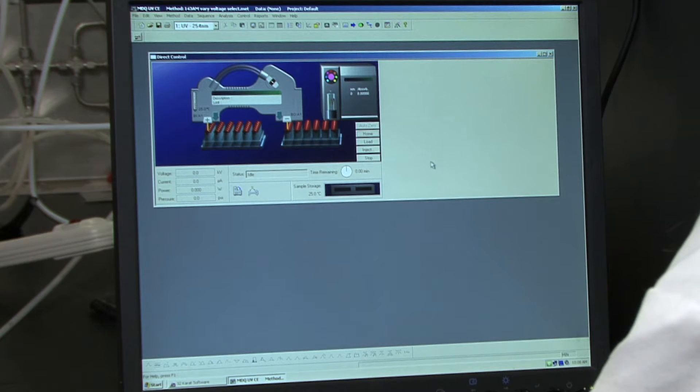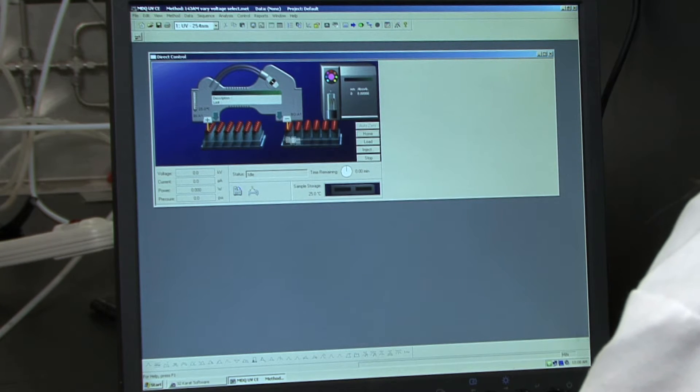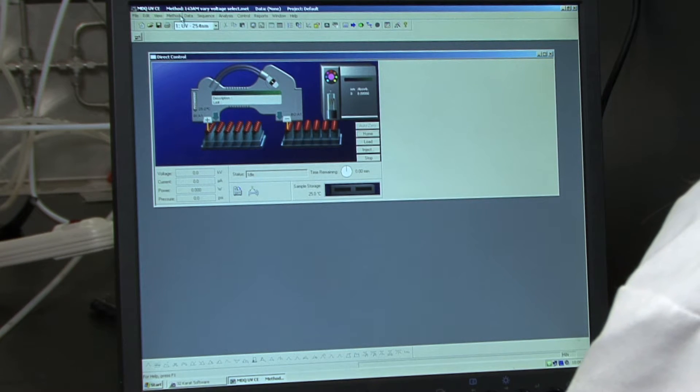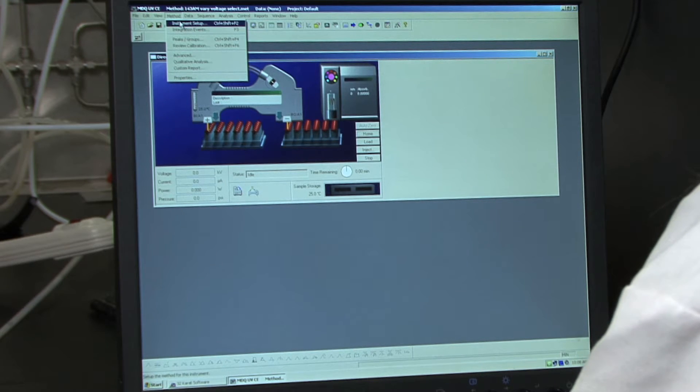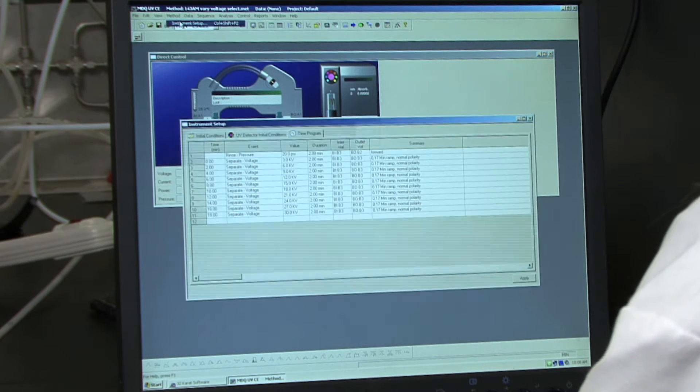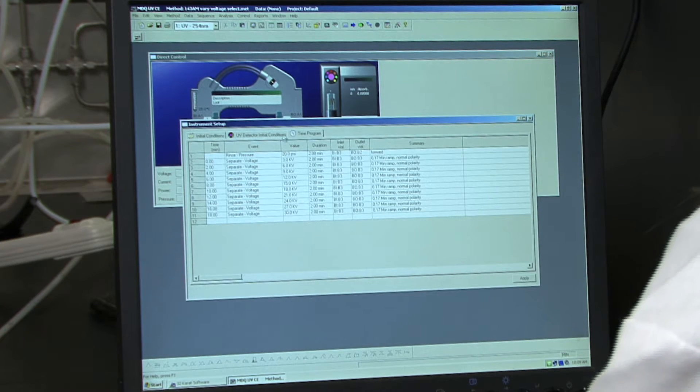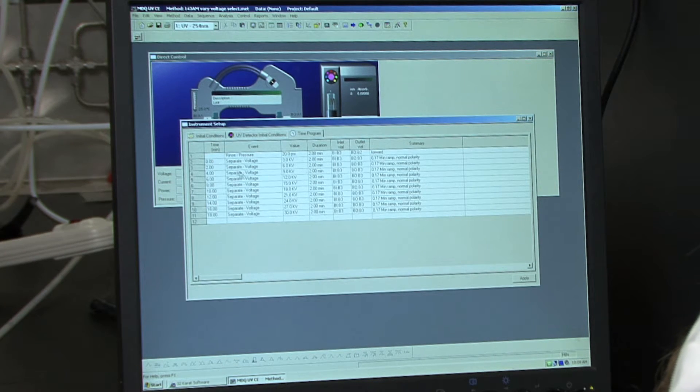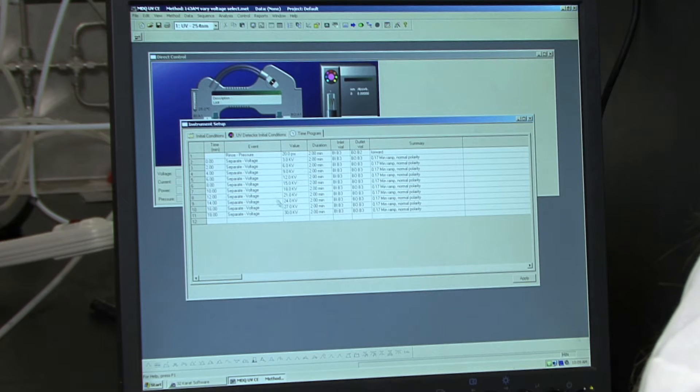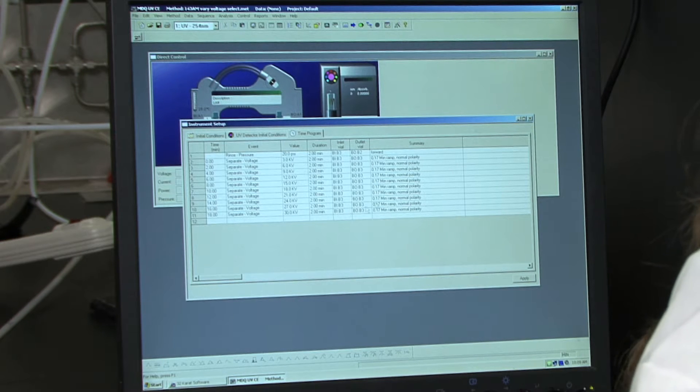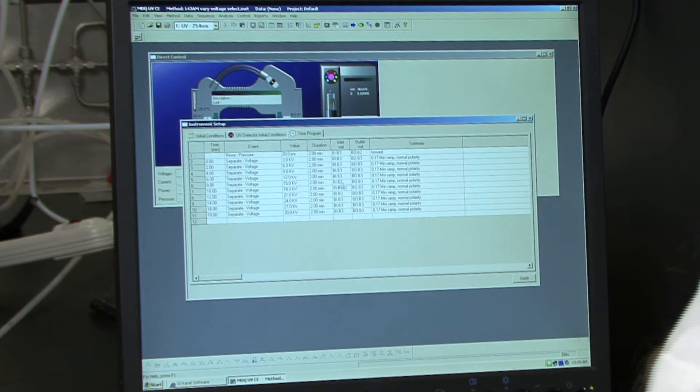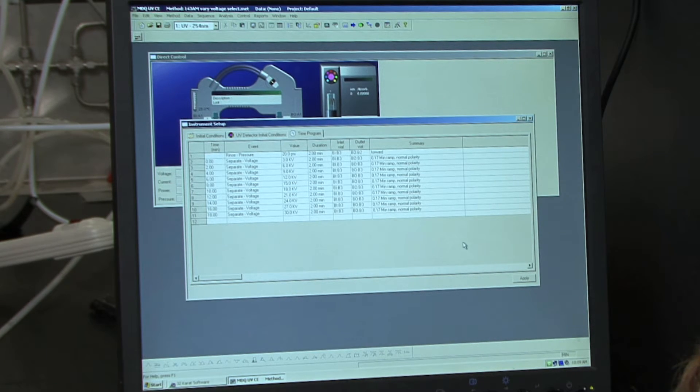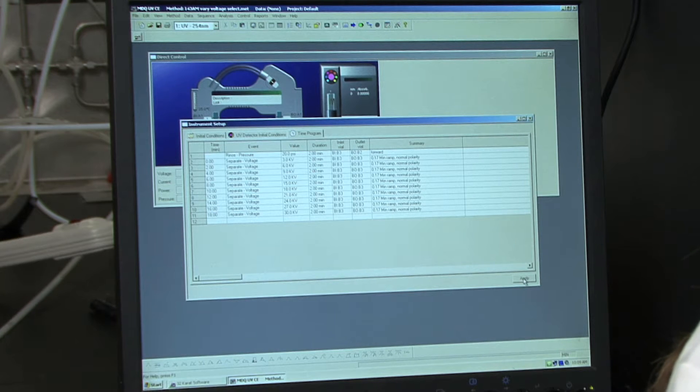To view the method, you go to method, instrument setup. And here you can view the method that will be loaded. So hit apply.